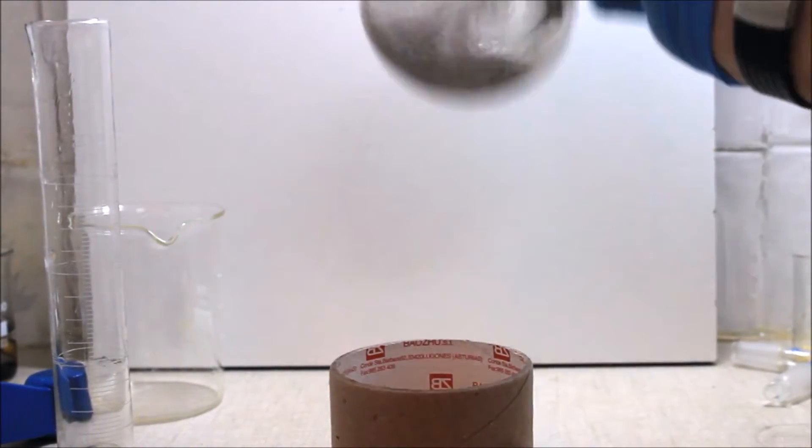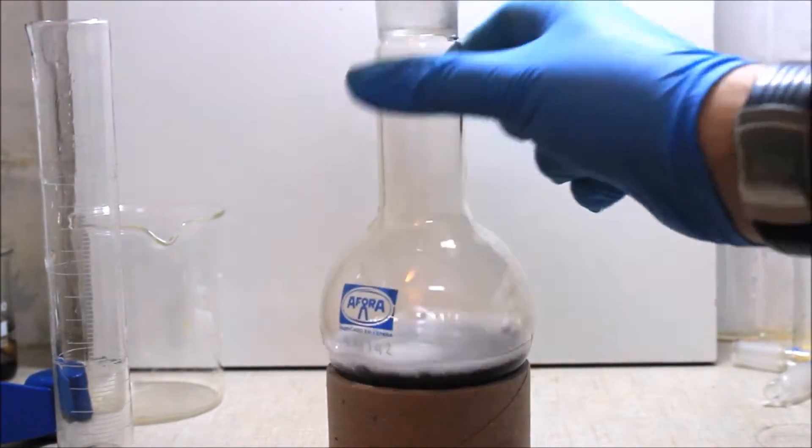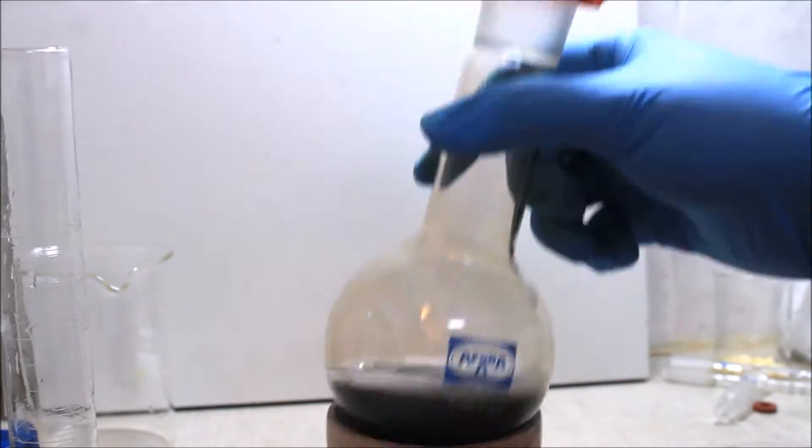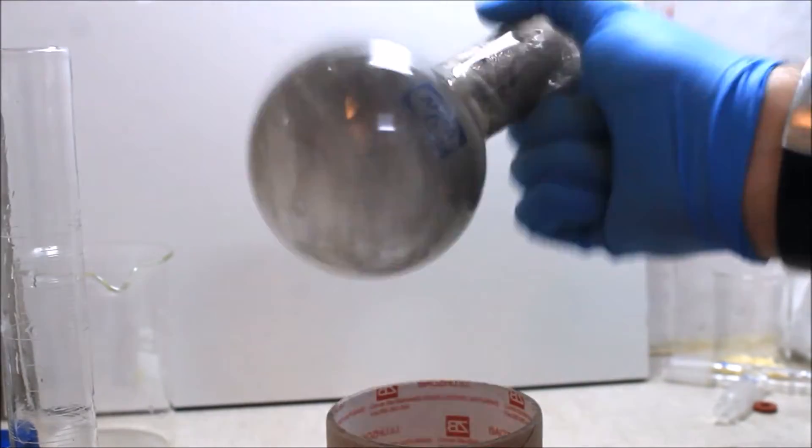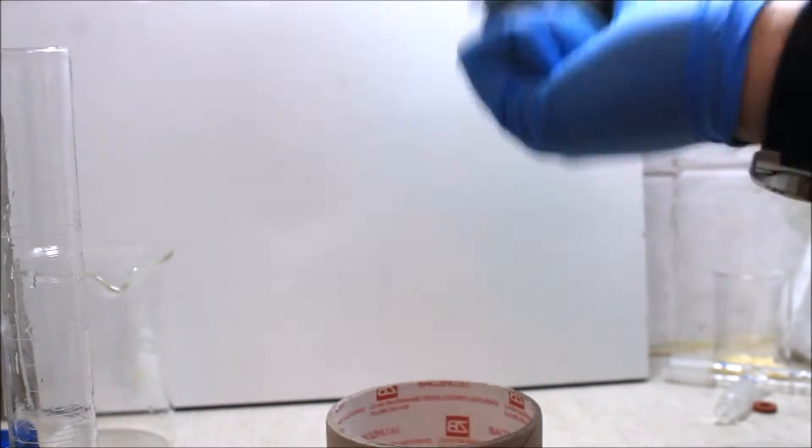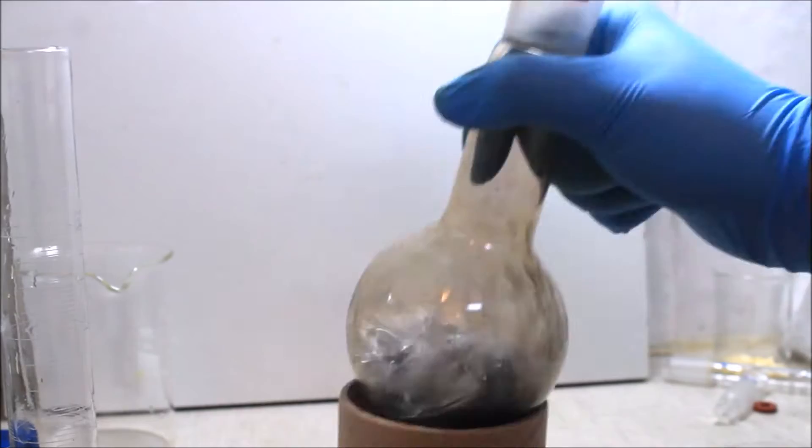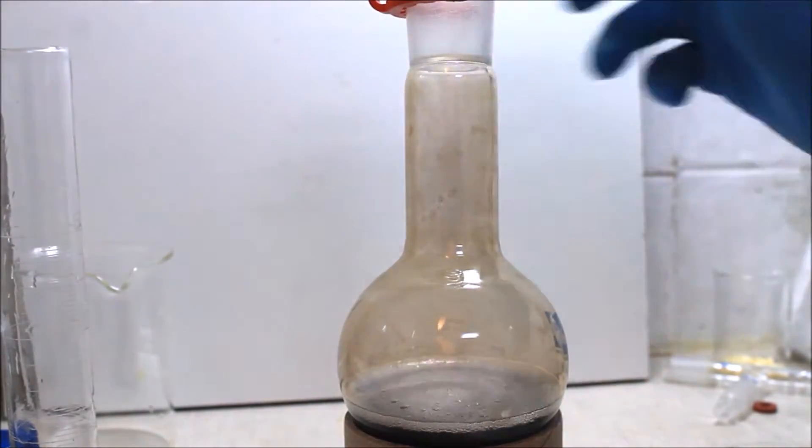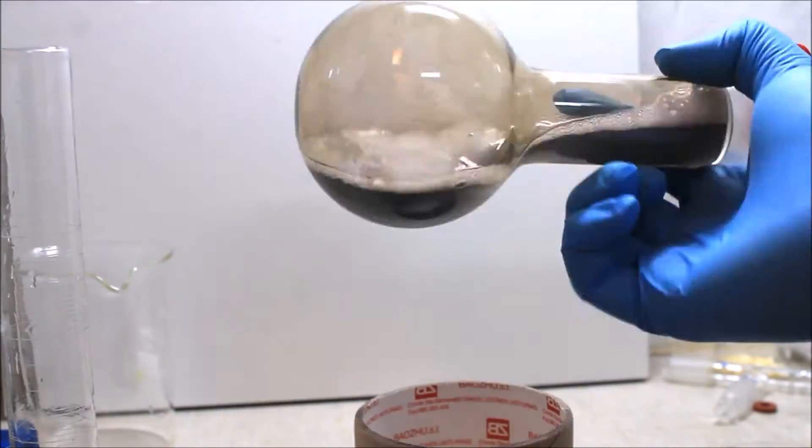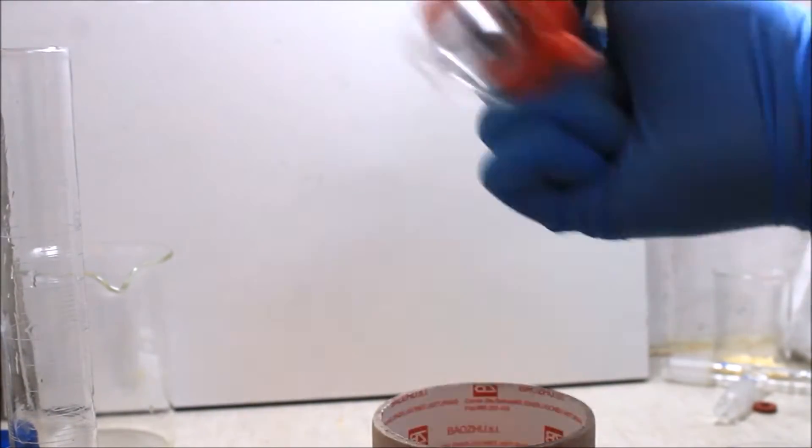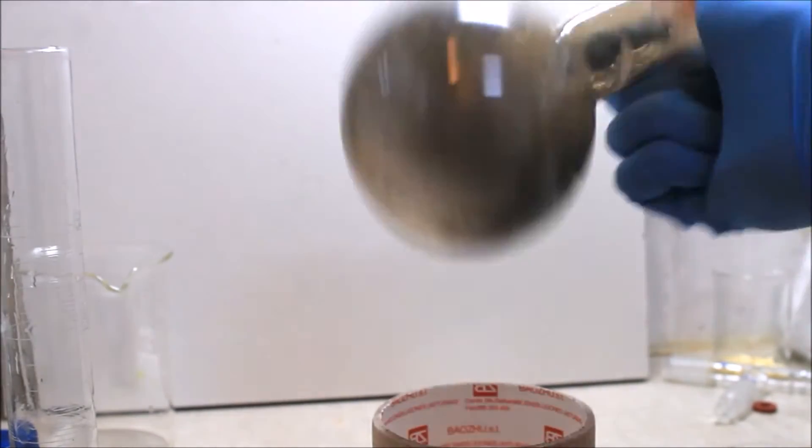As the reaction proceeds, the glucose reacts with the silver diamine complex in the presence of hydroxide to produce metallic silver. As you can see, the solution goes from a yellow to a brown-black color corresponding to the presence of silver microscopic particles in suspension.